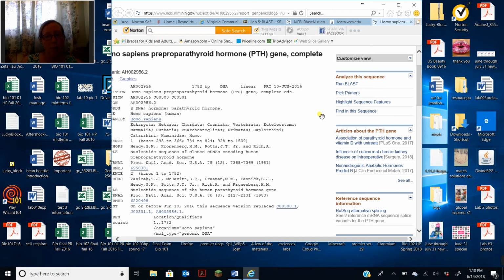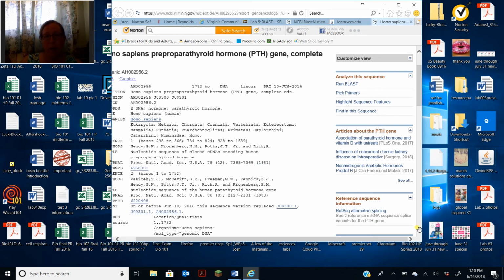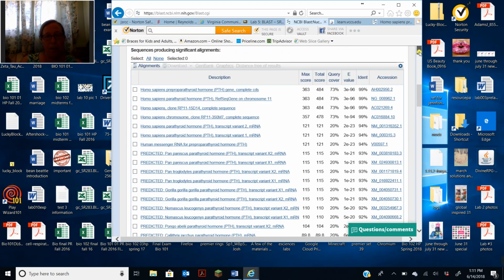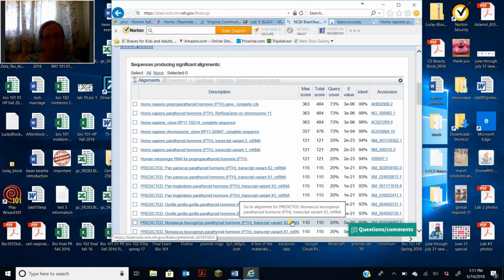There are other programs that do this out there, but this just happens to be one of my personal favorites. So anyways, whatever information you're looking for, sometimes it doesn't give you, like the page we were just on. If you are up in this region here, you might not get any of these. It just might start with predicted, and so then you're talking about the messenger RNA, right? So you might have to dig a little bit more to find what that is.